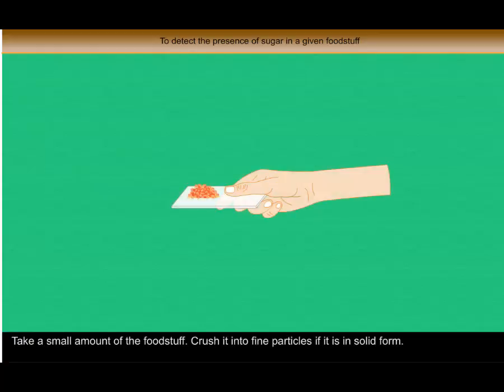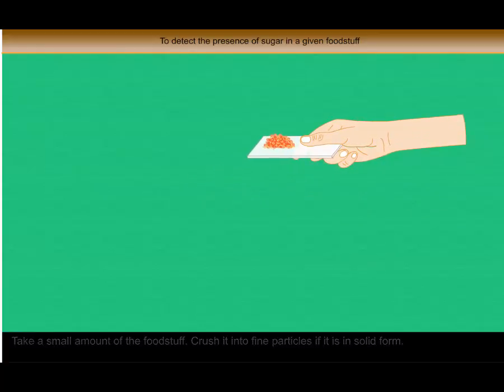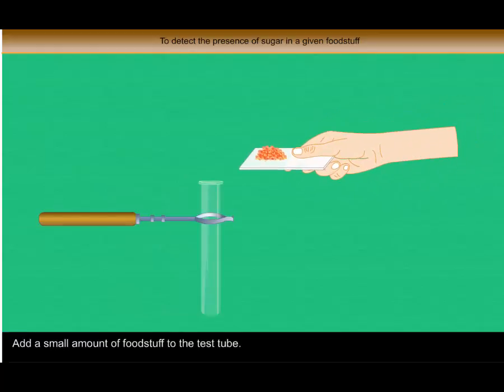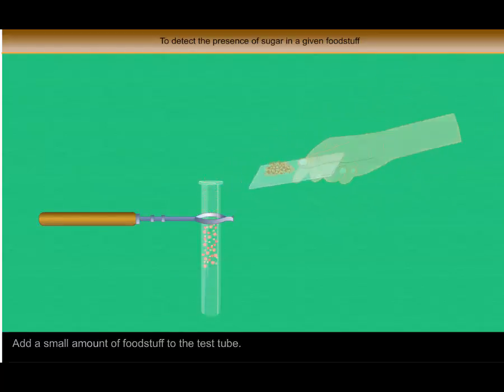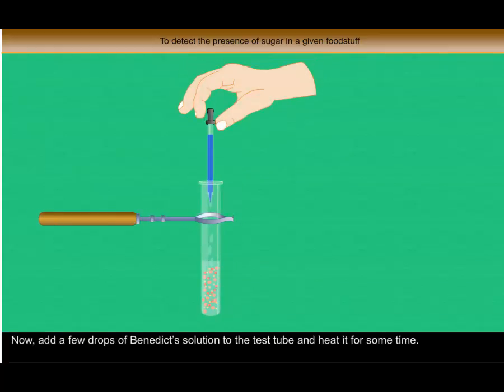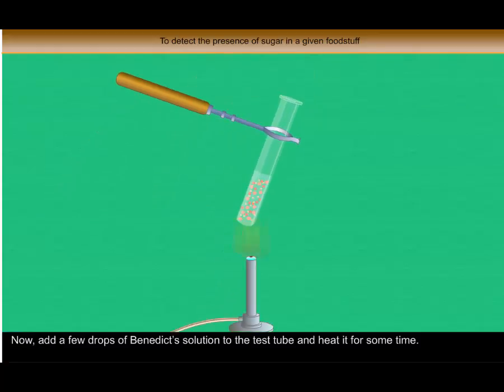Procedure: Take a small amount of the foodstuff and crush it into fine particles if it is in solid form. Add a small amount of foodstuff to the test tube. Pour some water into the test tube and shake it properly. Now add a few drops of Benedict's solution to the test tube and heat it for some time.